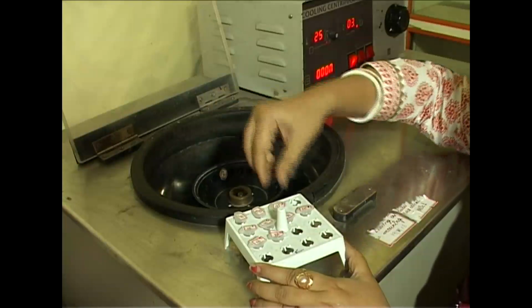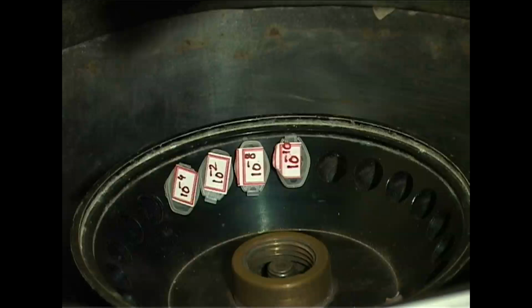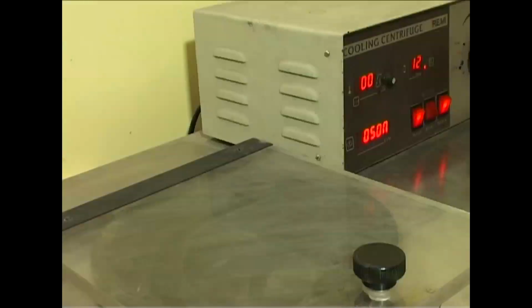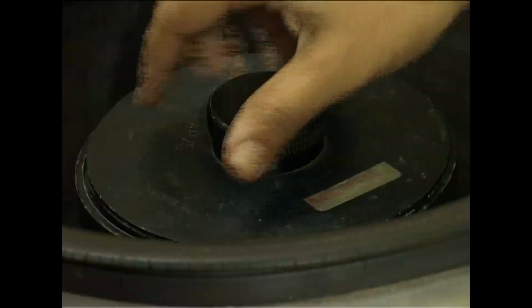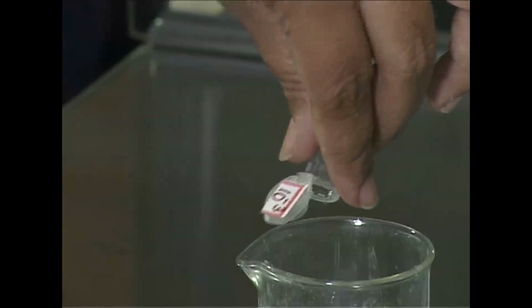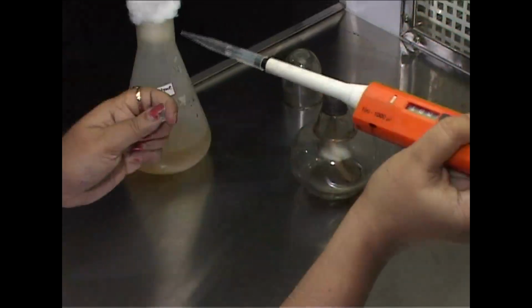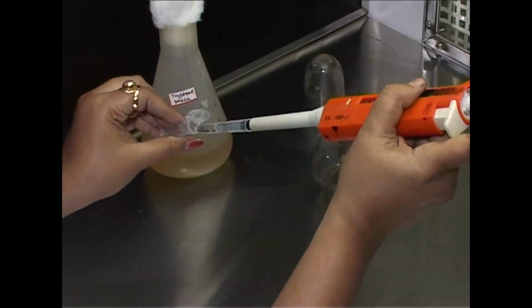The cells are centrifuged at 500 rpm, that is rotations per minute, for 10 minutes in sterile centrifuge tubes, and since the cells are heavy, they will come to the bottom of the tube. So, we will discard the supernatant and collect the pellet. Now, we will add a few ml of broth to the pellet and resuspend it.